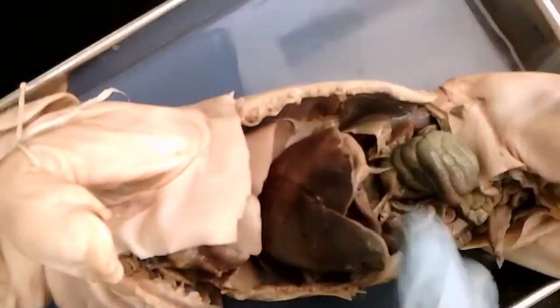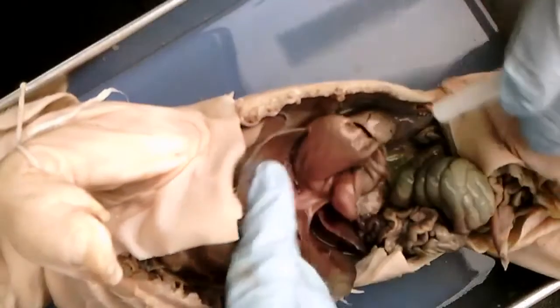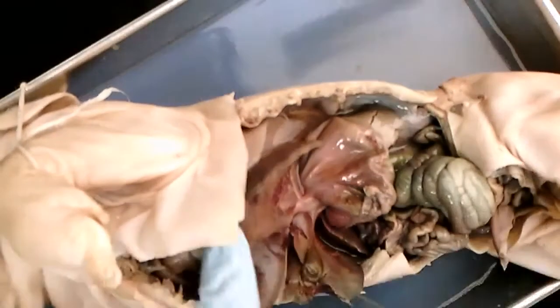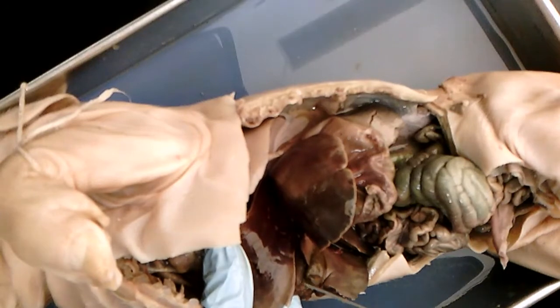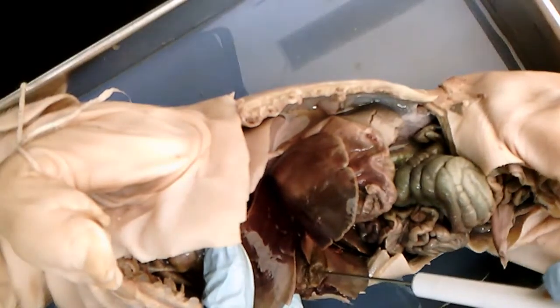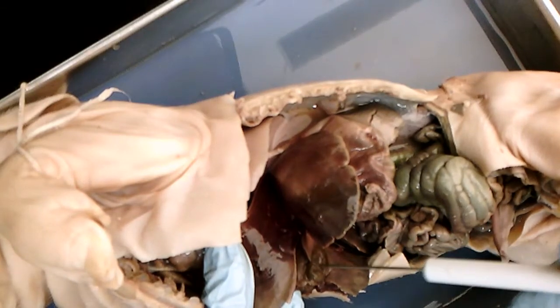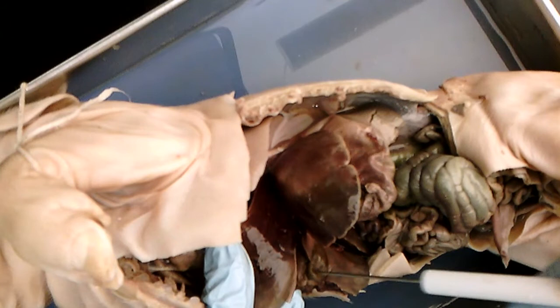It's usually, I've always seen it attached to the stomach. It's kind of a green. Yes, between the stomach and the liver. Look above the stomach. Oh, there it is. There it is. Yep. Here is the gallbladder. I don't know if you can see it. That's the gallbladder. So that could be potentially challenging to identify, especially if you've incorrectly cut.